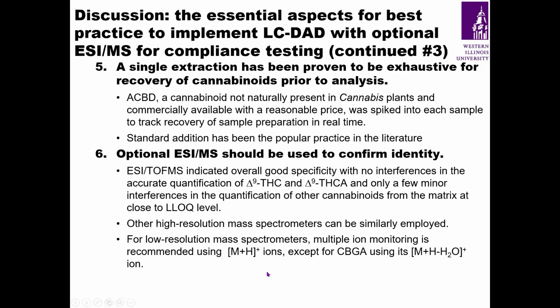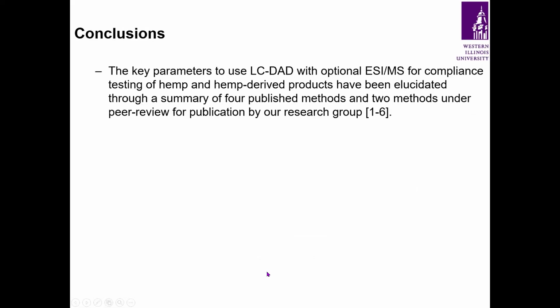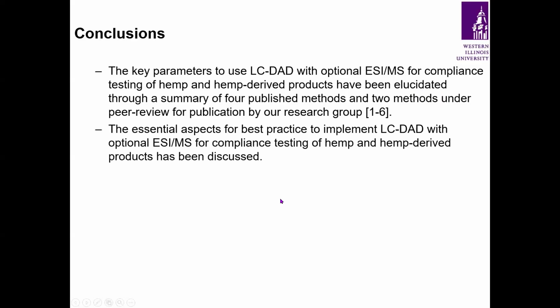All right, here are the conclusions. The key parameters to use LC-DAD with optional ESI-MS for compliance testing of hemp and hemp-derived products have been elucidated.